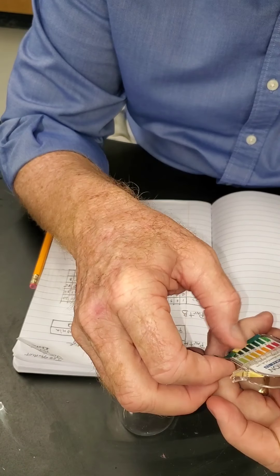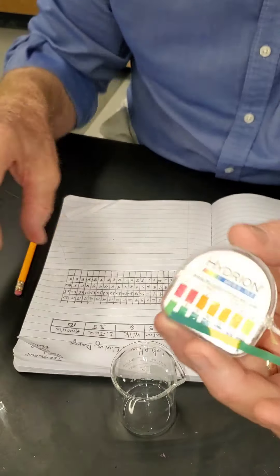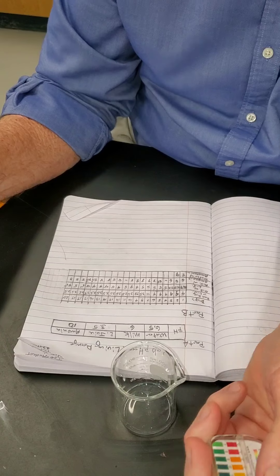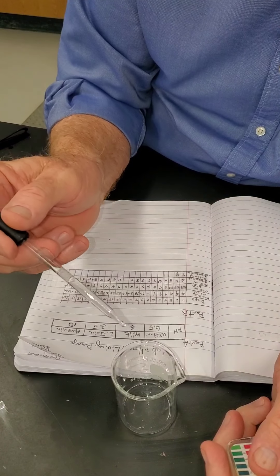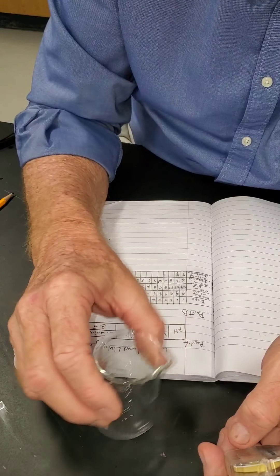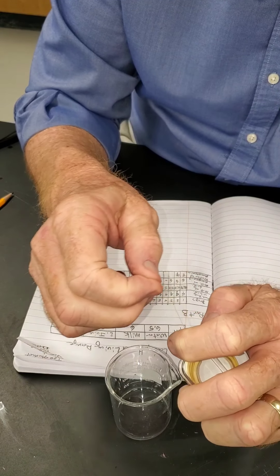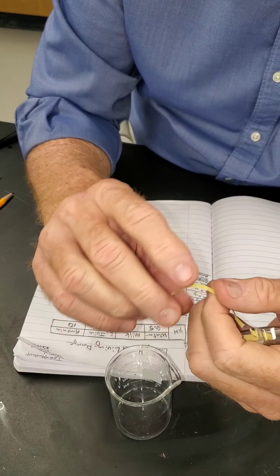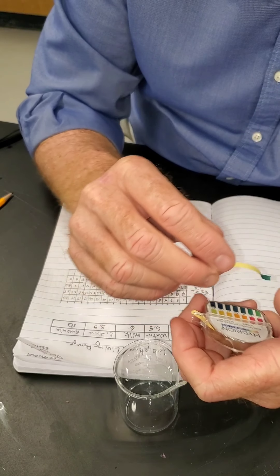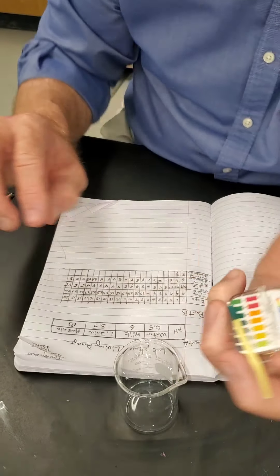That's one of our big questions for this lab. After drop two it went from 8 to 9. We continue adding drops, swirling each time, getting our pH paper out to check. It takes a lot of pH paper to do this lab. We're still at 9.